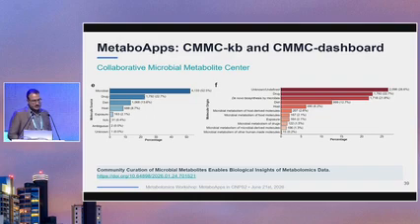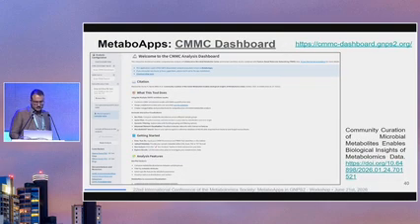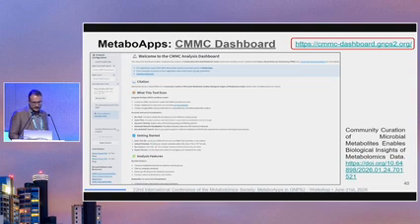As I mentioned, it's not exactly the same information you get for drugs or for foods as if you're using the readouts, because these ones combine the information with microbial information. So you're not going to have the same information as the other two, and also it's not necessarily the same annotation that you're going to get. So yeah, this is the overview of the tool if you want to access it.